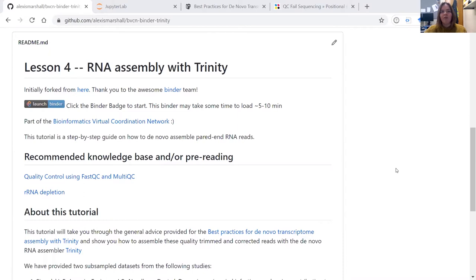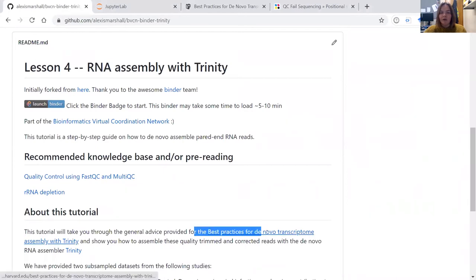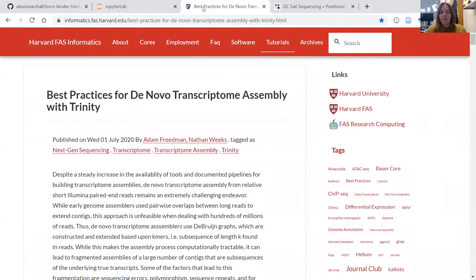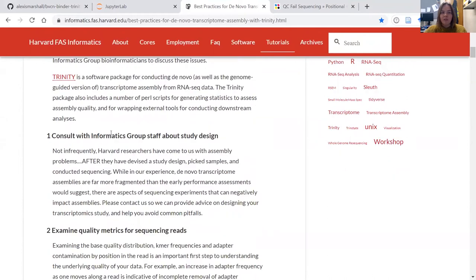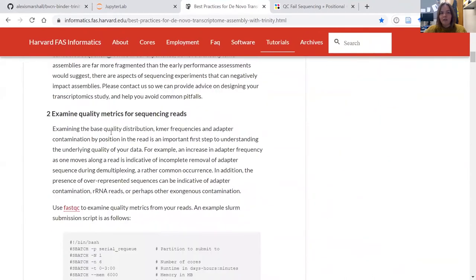Today, as part of the Bioinformatics Virtual Coordination Network, I'm going to be taking you through a short tutorial on how to assemble RNA reads. This tutorial relies very heavily on the advice provided in the best practices for de novo transcriptome assembly with Trinity blog posts, which you can find through the link provided. This blog was written by Adam Freeman and Nathan Weeks, and it goes through all of the steps involved in trimming and cleaning RNA data before you should assemble it.